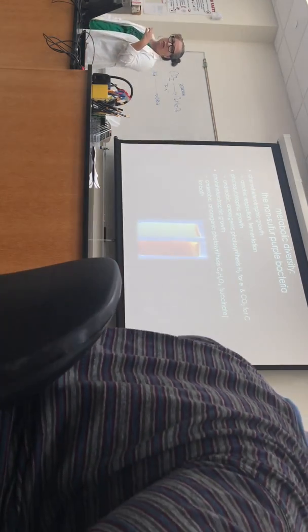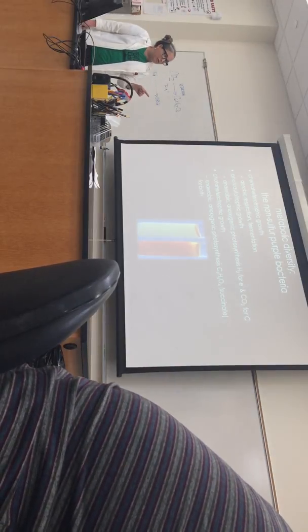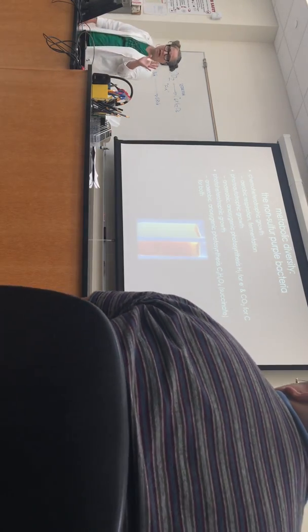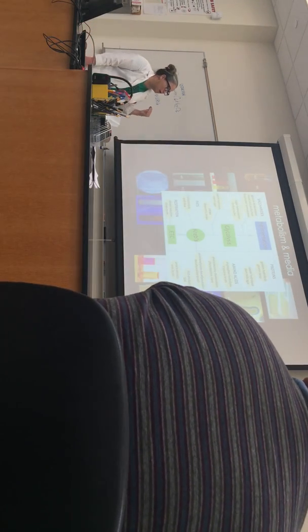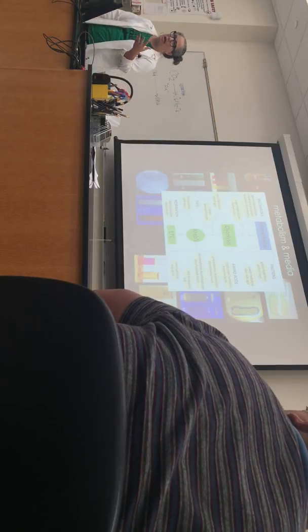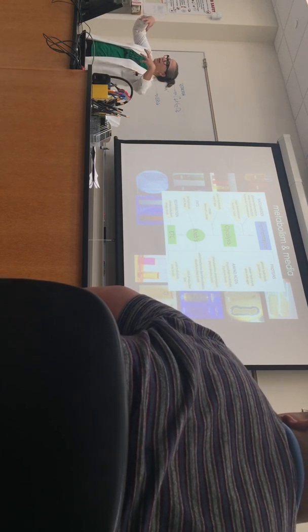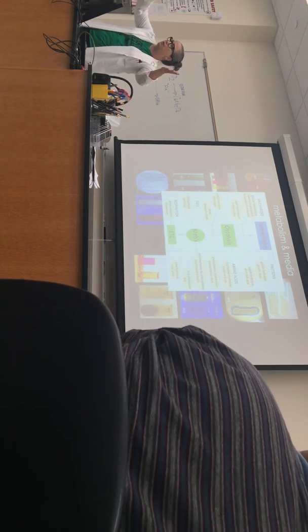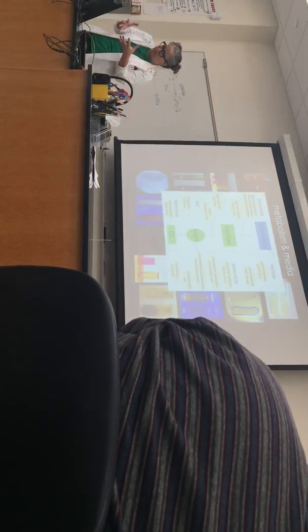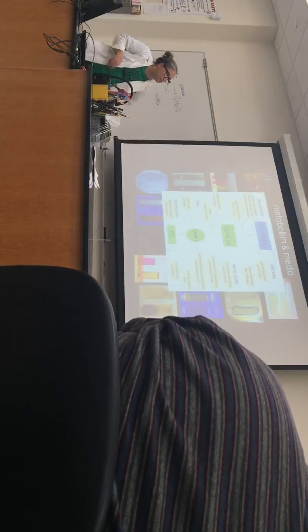And why do we care particularly so much in microbiology? Because we use all those little arrows to tell us who we've got in front of us, right? We can't see a lot about them, so we infer who they are by looking at what they eat. So the last half of this lab, starting with lab, I think it's 20, you will start inoculating your bacteria into all sorts of media, feeding them all sorts of crazy stuff to see if you can eat it. If you have the enzyme, you have the gene, and now I know one thing about your genome. And I can look for all sorts of craziness, right?